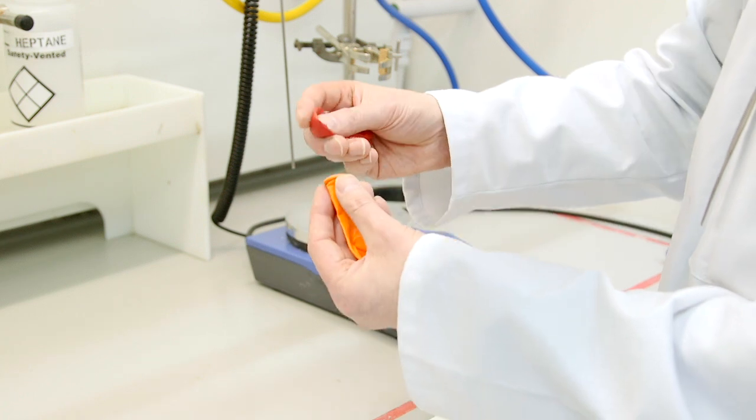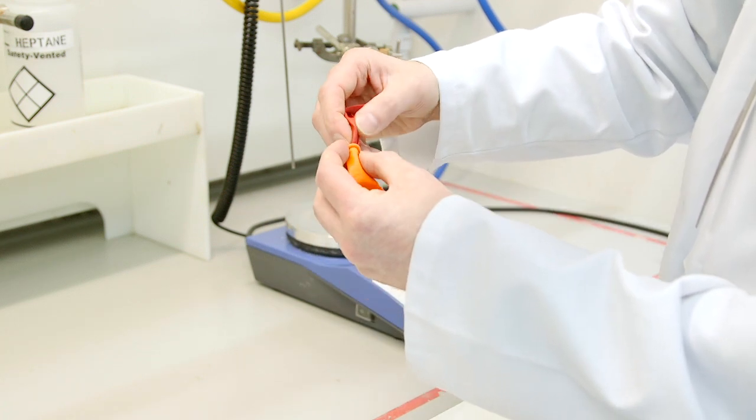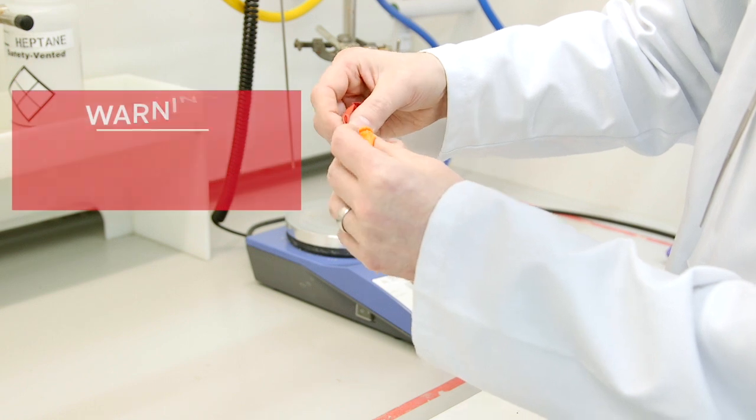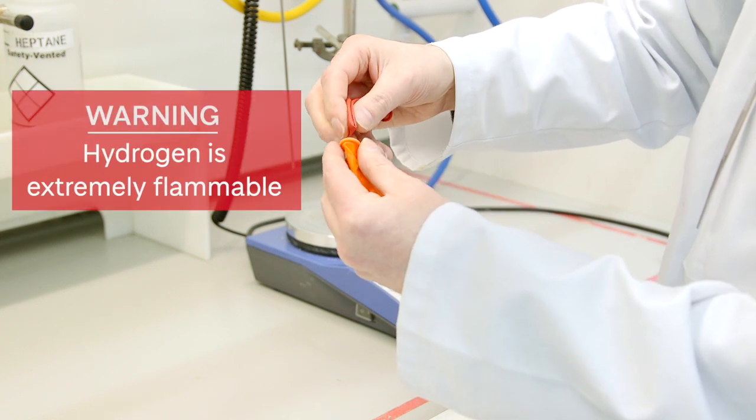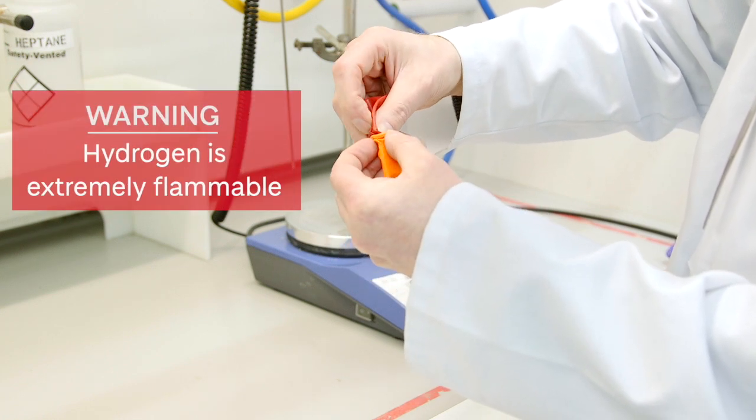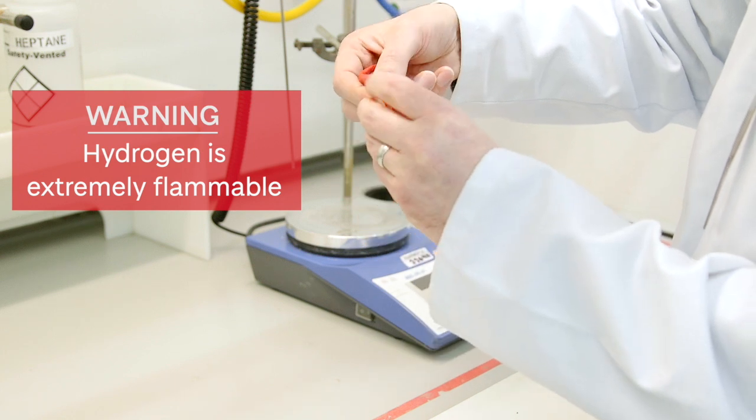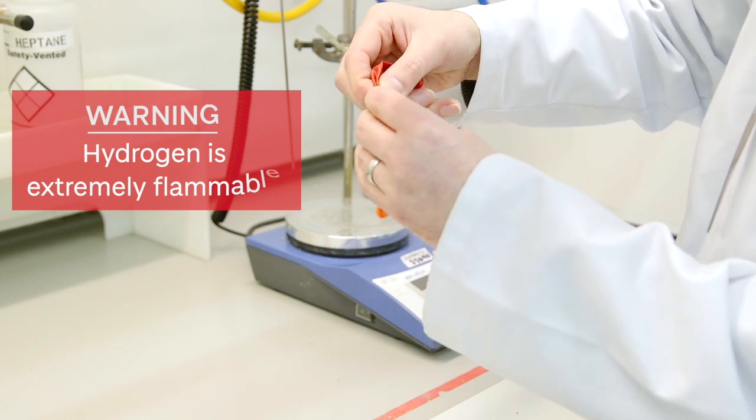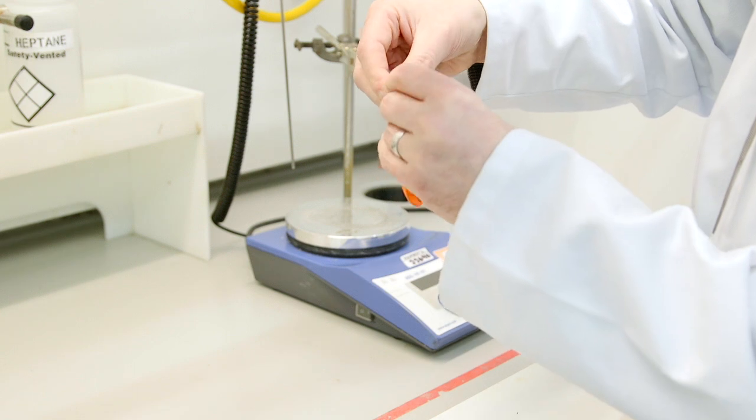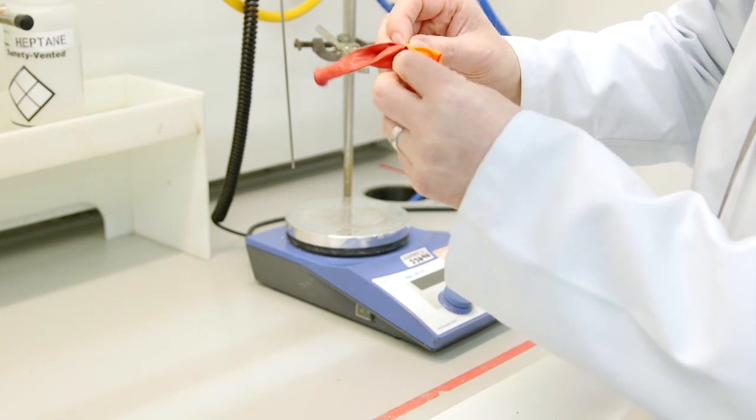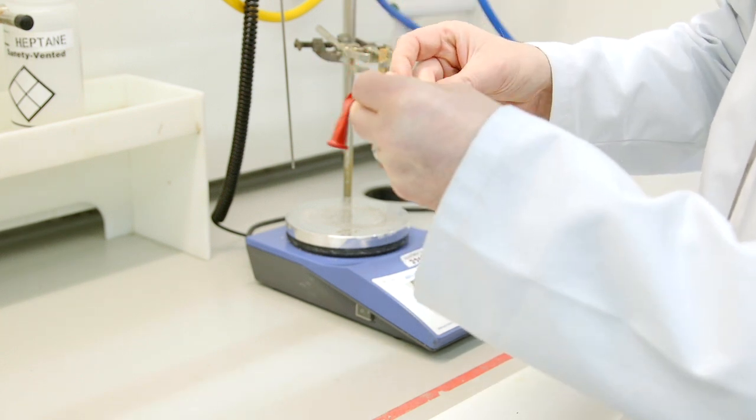To begin we are first going to make our balloon for the hydrogen gas. Hydrogen is a very flammable gas and as such we need to take an extra level of care than we would do for other gases such as nitrogen. If we make a nitrogen balloon we would use a single balloon, but for hydrogen we use two.